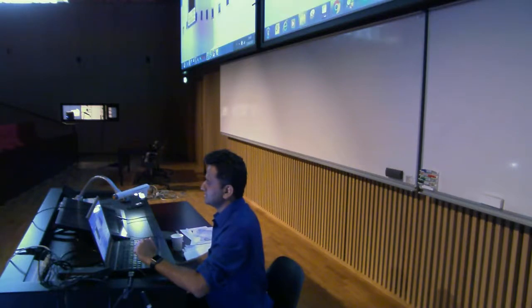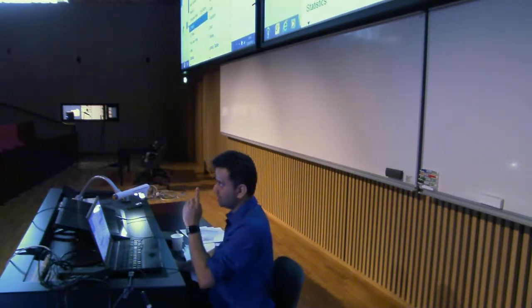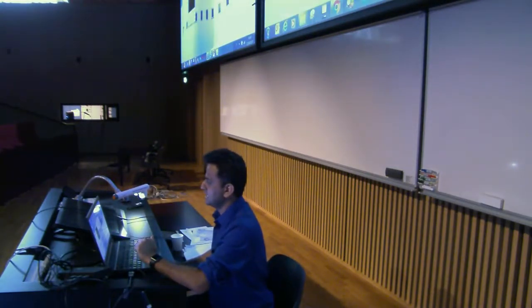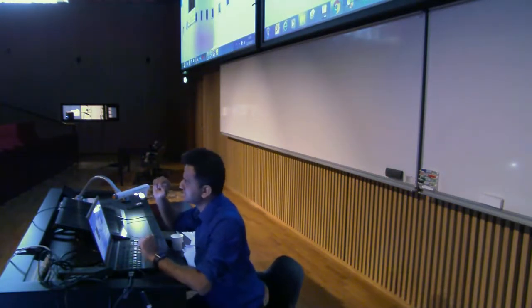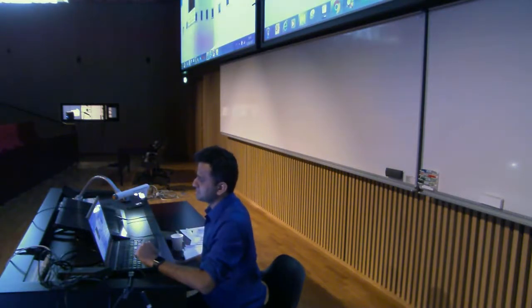Let's say I'm interested in Image, Stacks, and Z Project. Maybe I'm only interested in looking at the maximum intensity projection. I'm not interested in all the Z stack, but only one Z slice that has to be the maximum intensity projection. How do I do that? Go to Stacks, Z Project, and I'm telling it that I have slices 1 to 5, make it a 1 slice based on maximum intensity. Does everyone know what maximum intensity is? It goes through each and every pixel over all the slices and only picks the pixel which has the maximum intensity, and thereby you just have a 1 Z slice.